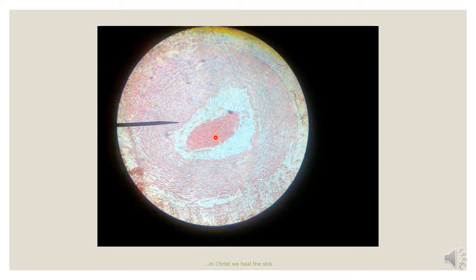So we can identify the lumen as this part containing some blood cells, and then the tunica intima, which is narrow, and the tunica media, which is made up of concentric layers of smooth muscle cells. It can also contain little or no elastin fibers. Then we can identify the tunica adventitia, which is adjacent to the connective tissue surrounding the artery. For the muscular artery, the muscular tunica media is usually relatively wide compared to what is seen in its corresponding muscular vein.